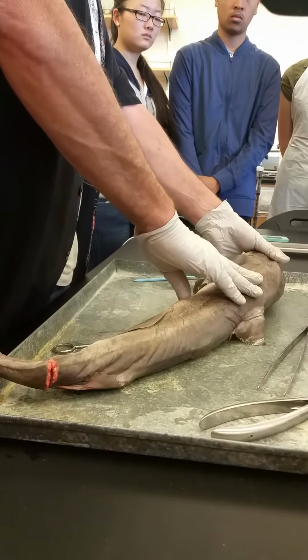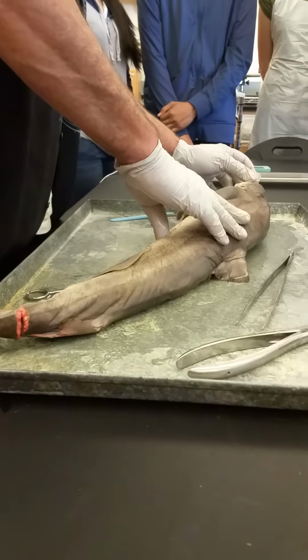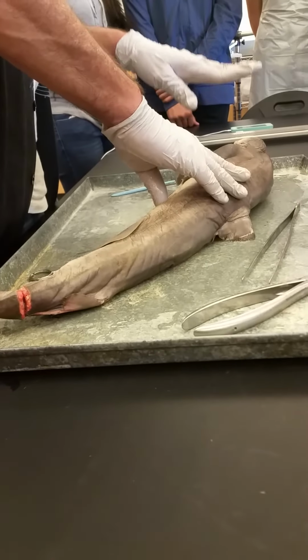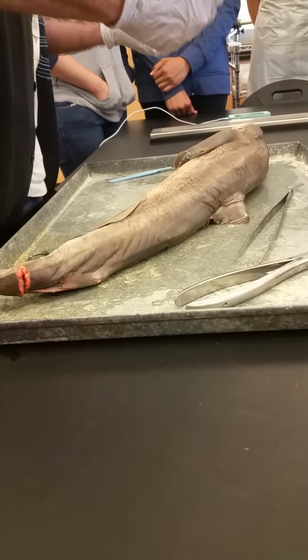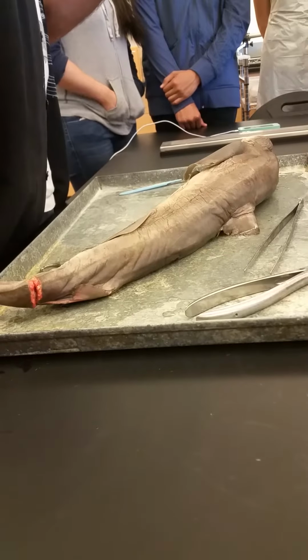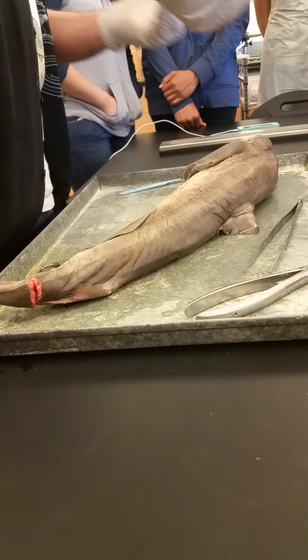This family of sharks is again that mid-water, dim light part of the ocean. So very well-developed eyes with a reflective layer in the back, which we'll talk about in lecture tomorrow, if we get that far. Like a cat's eyes, where you shine a light at it and it glows back at you. So dim light, so they get two chances to see the light. It shines through their retina once, bounces off the back of their eye, back again. So it gives them two chances to see the light, makes their eyes very sensitive that way.